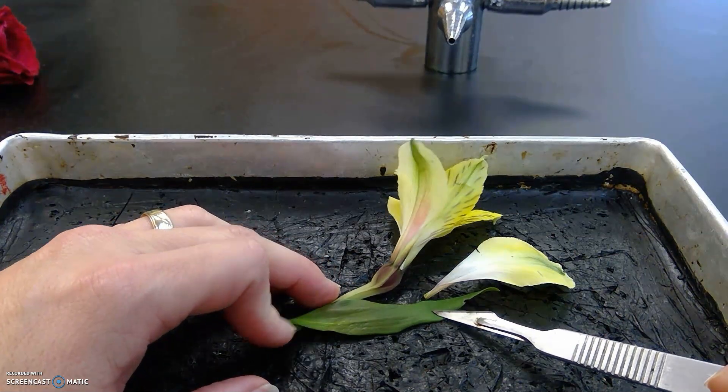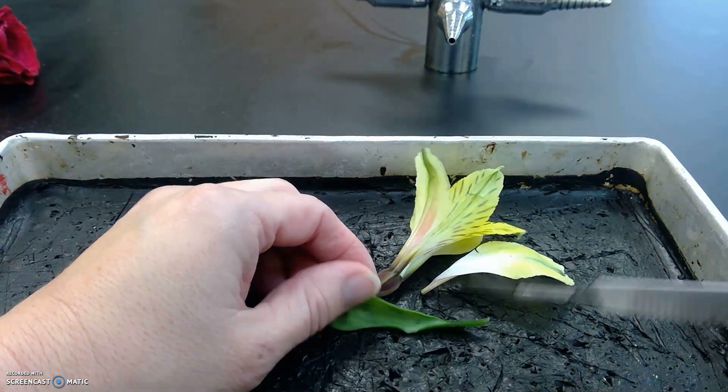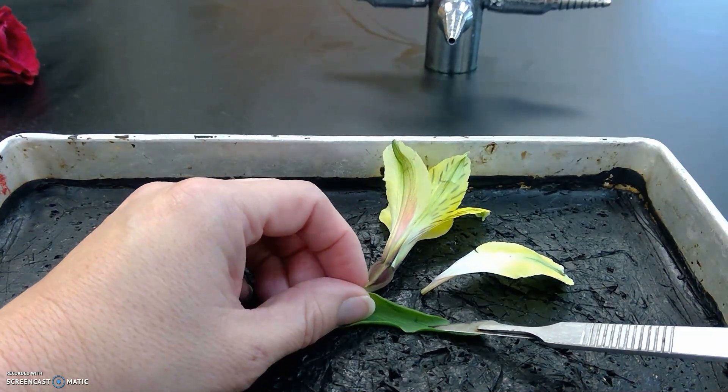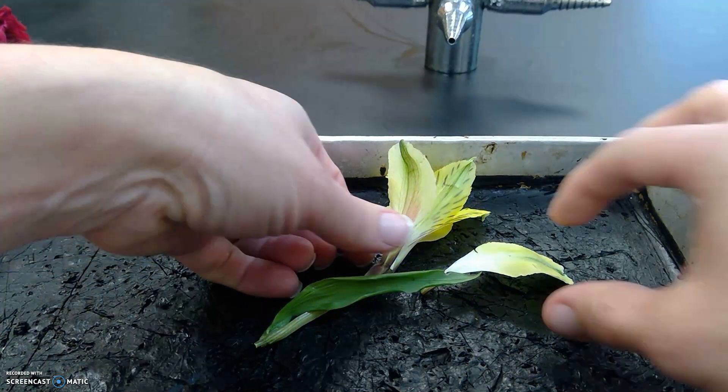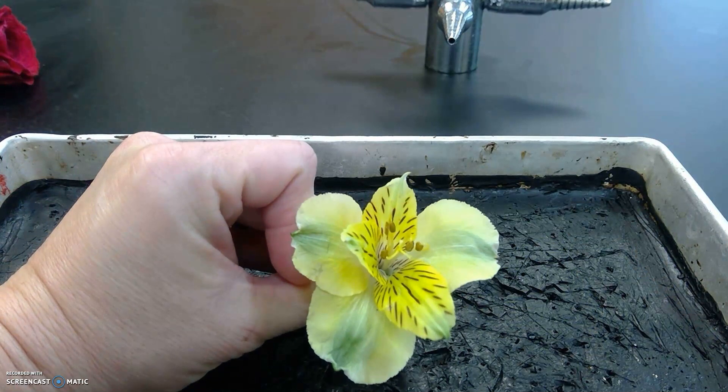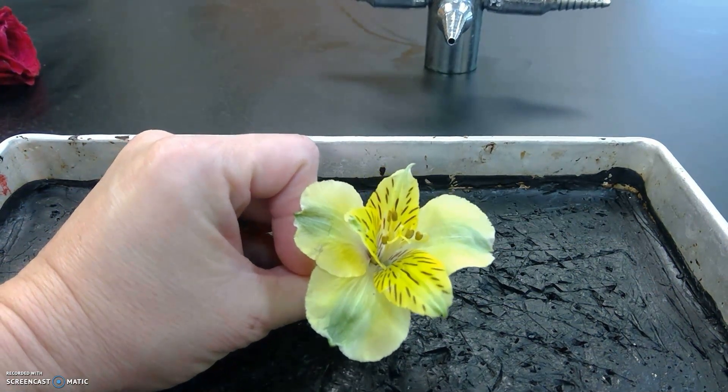Looking at this leaf, you can see probably better on the underside that this is a monocot because its veins are parallel. It's also a monocot because you can see that its flower parts are in threes. So this is Astral maria.